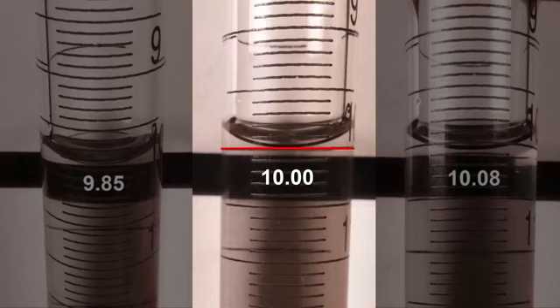Lining up the encircling line closest to the meniscus so that it appears as a solid line ensures that the reading is taken from eye level and avoids parallax error.